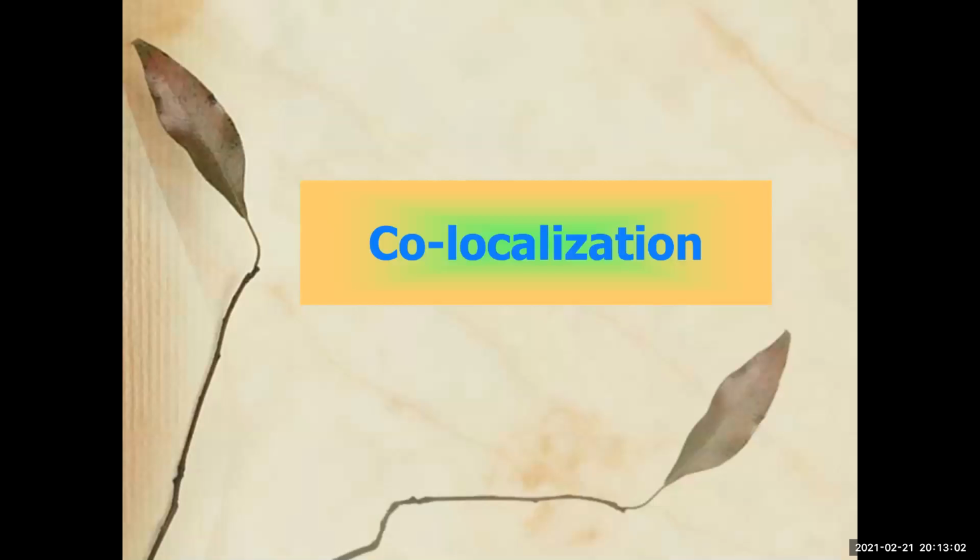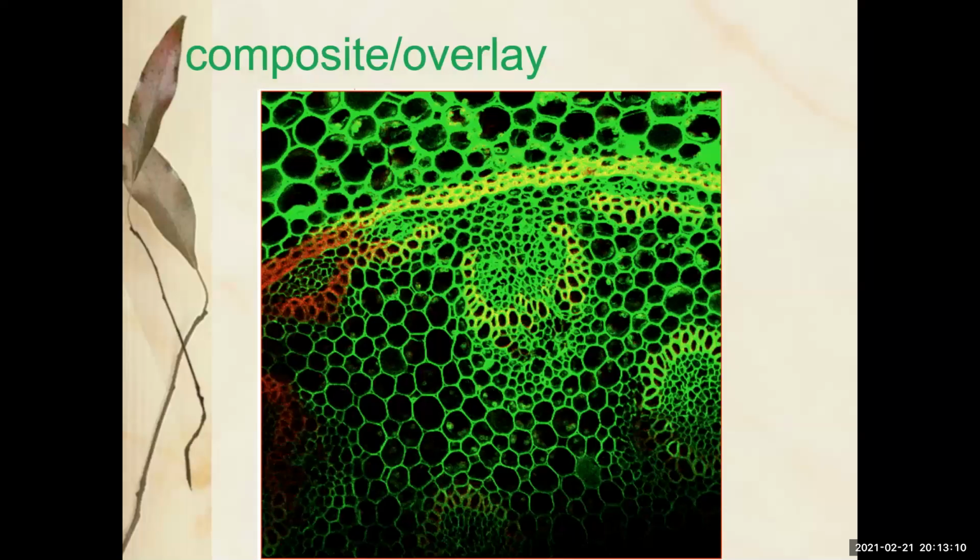Oh, for a second, let's think about colocalization while you're doing composites and overlays. The point is to see, where do things colocalize? Where are they in the same spot? Because what you're getting out of your image are two things. One is, how bright are things, which is very tricky to keep track of, but is there a signal at all?